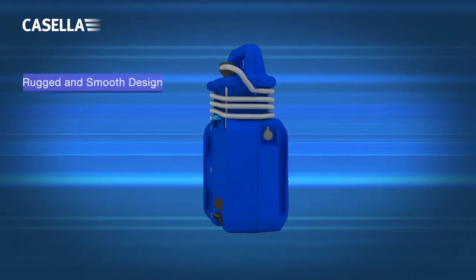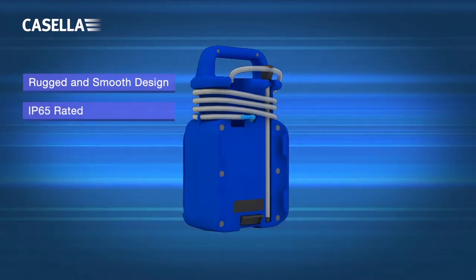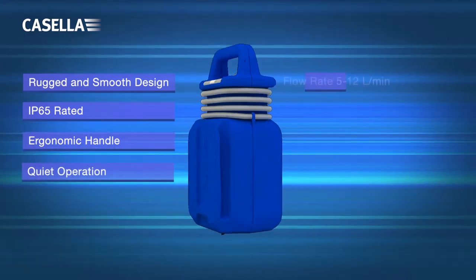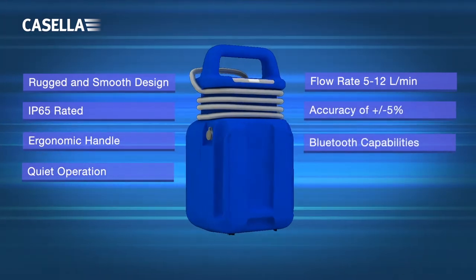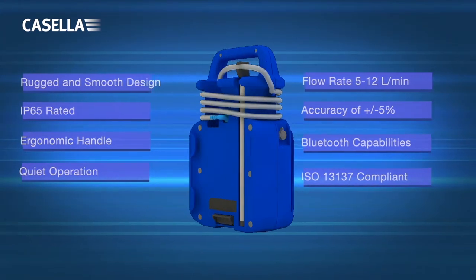The Vortex 3 is a high-flow air sampling pump designed for stationary sampling of asbestos and other airborne hazardous materials. The flow rate can be adjusted between 5 and 12 litres per minute, with an impressive back pressure capability enabling a wide range of filter media choices.